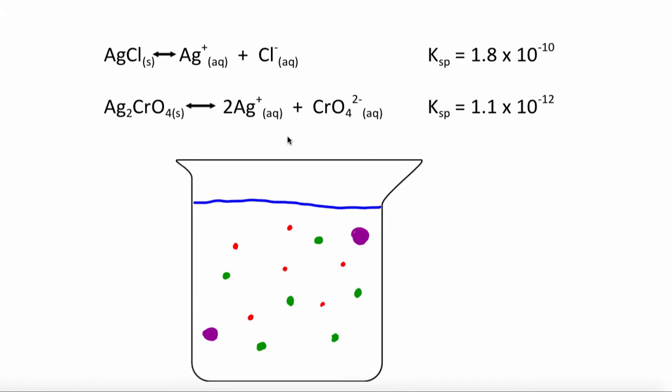Hey everyone, I thought I'd make a little screencast for you about Lab 7S where we did our Mohr titration, our chloride analysis based upon the potato chip filtrate that I had made for you. So let's start with just an overview of what we had in the mix.